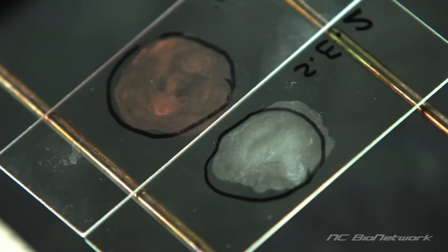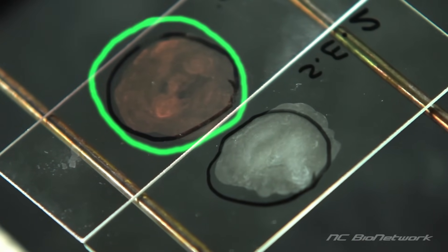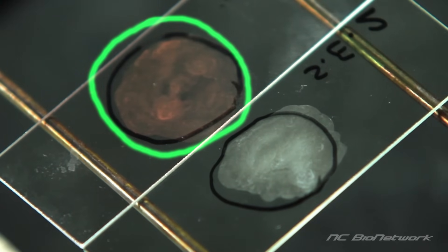Here you can see the difference. The slide on the left is our stained slide. The slide on the right is unstained.